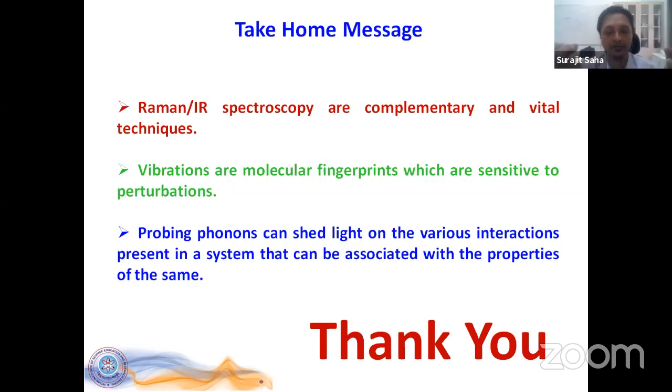Now, in the presence of electrons or holes, one has to see whether the phonons that I'm probing through Raman are able to interact with those charges. If yes, then only there will be implications of that doping onto the phonons, and then one may be able to really see it. It may not be very straightforward to say that this is how one should be expecting a change. One also needs to build up some theoretical model to really analyze the data. It will not be very straightforward.